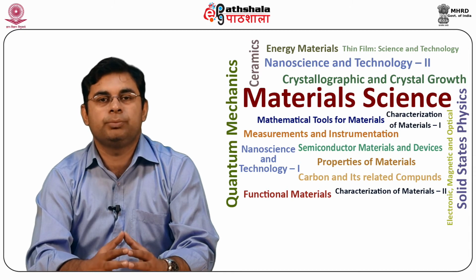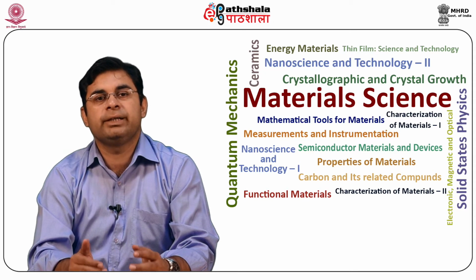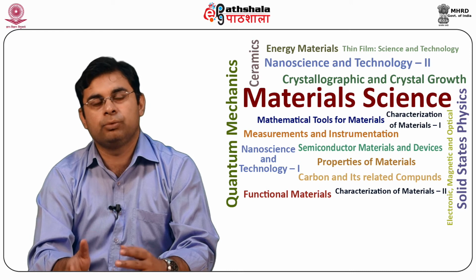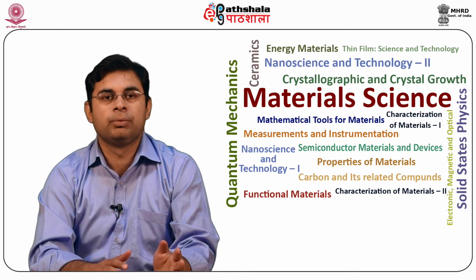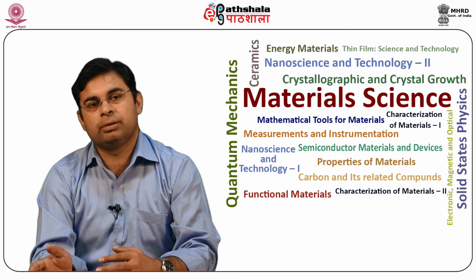Scanning probe microscopy, that is SPM, is a branch of imaging techniques that scans the surface with a very sharp probe, whose contact diameter may vary from the size of a few atoms to tens of nanometers.